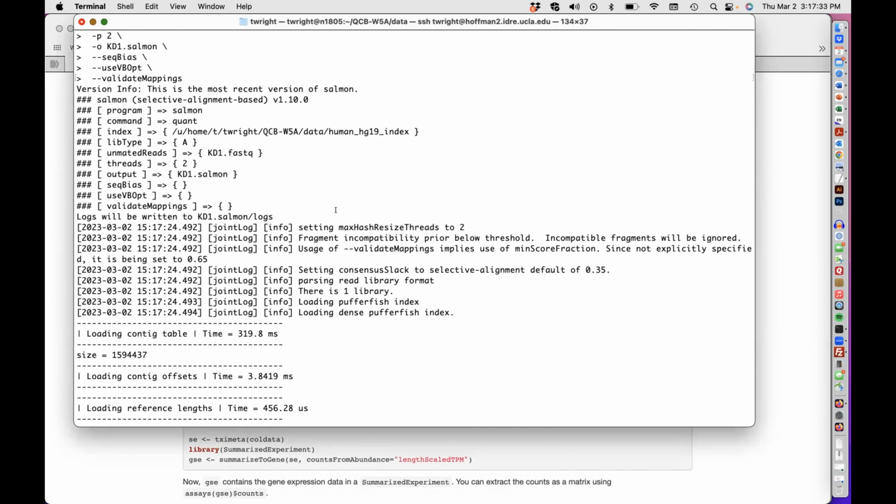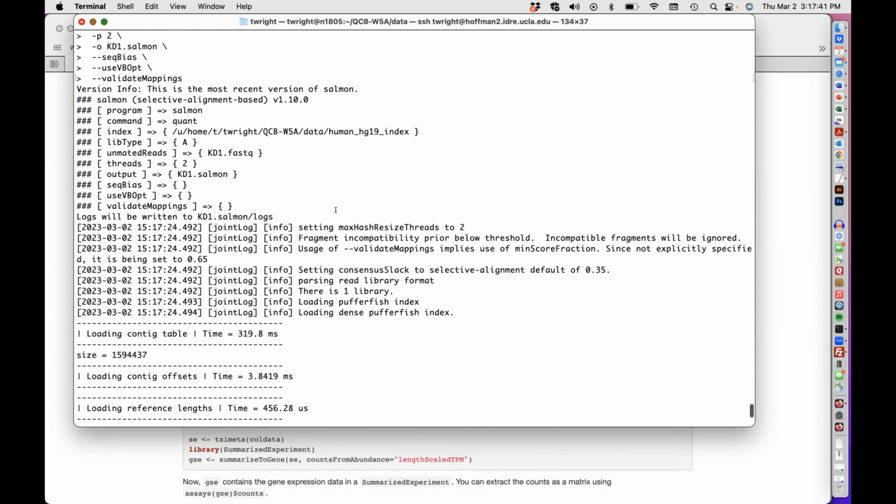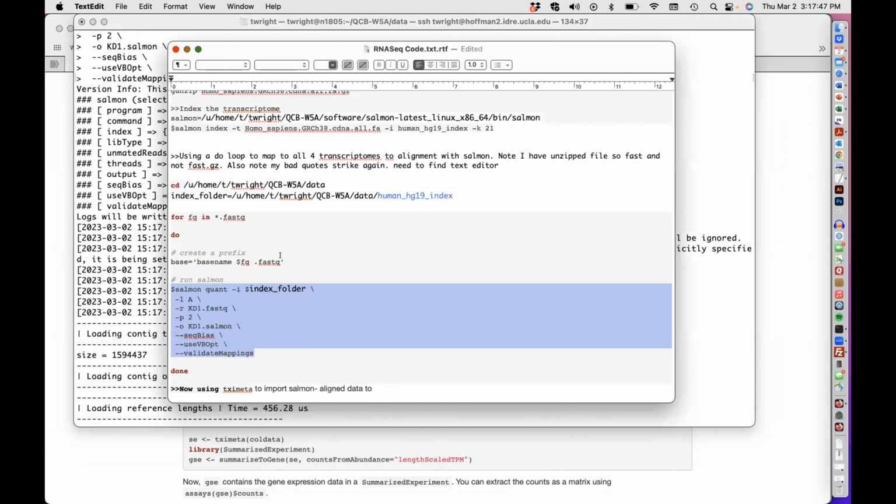All right. So somehow it's just that one line of code that's creating the variable name base. It's not recognizing the command basename. Try rewriting it. You can also try double quotes instead of a single quote and see if that helps with the smart quotes issue there. But at this point, I think just having it done for one sample is sufficient. Sure, yeah. All right, I'll do that.